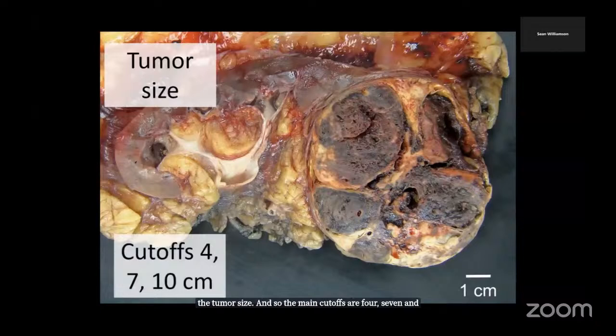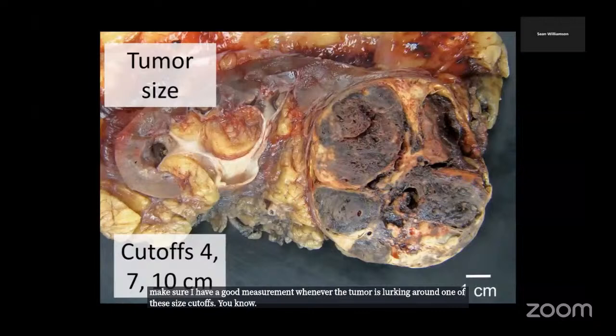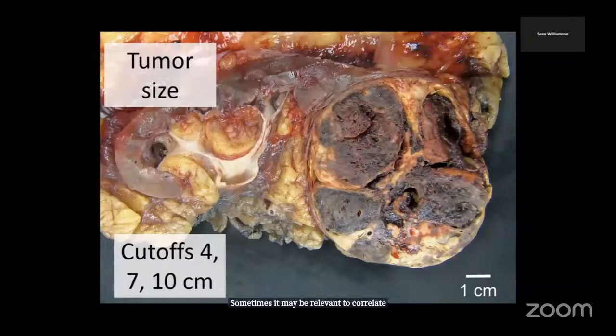So I always try to make sure I have a good measurement whenever the tumor is lurking around one of these size cutoffs. You know, if you're right around 4 centimeters, I try to make sure I can check all 3 dimensions. Sometimes it may be relevant to correlate with the imaging to see if the gross measurements that you're getting are similar to the clinical measurements.